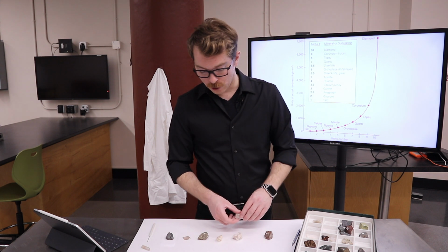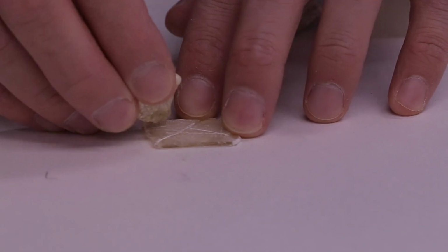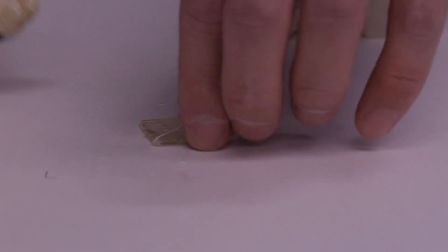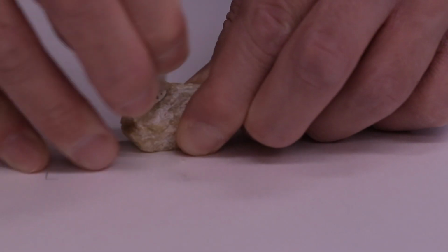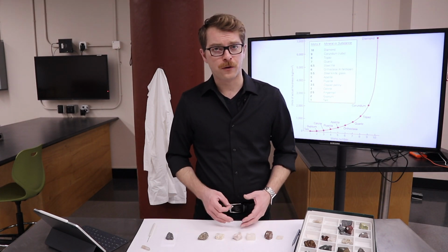Okay? So, we can do the same thing with gypsum. Talc is the number 1 on the scale. It's the weakest mineral, and if we scratch the surface of the gypsum, we might get some powder left behind. But when we take the gypsum and we scratch it along the surface of the talc, we're going to permanently deform the surface, okay? Now, you do need to watch out for that powder being left behind.